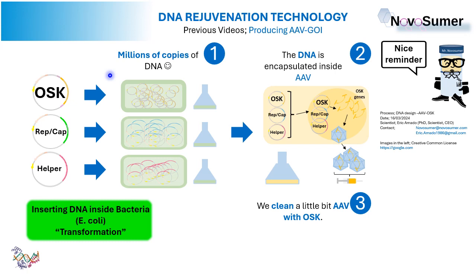That is the topic of today's video, inserting DNA inside bacteria cells. Remember, this process is called transformation. It's just inserting DNA inside bacteria cells. Okay? And after inserting the DNA in bacteria, they will produce the copies for us. As you can see here, the DNA is inserted in bacteria cells and they produce many copies.